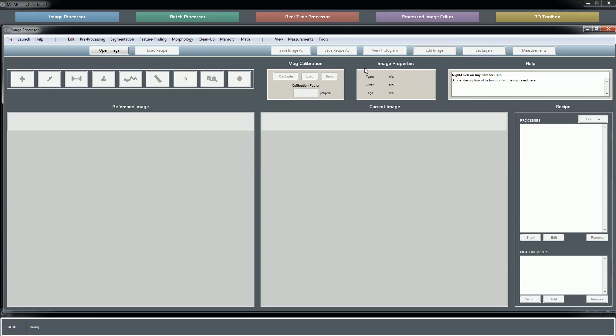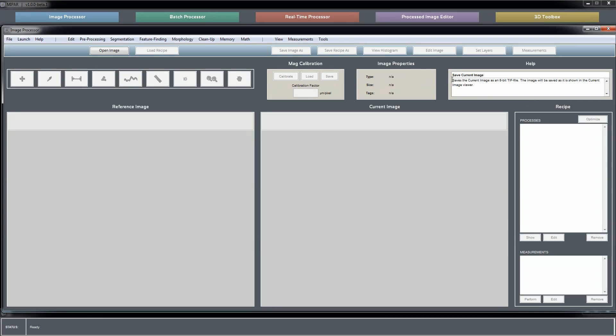Here we have our panel where various image properties are shown. Again, we'll get into this a bit more later, and here's our integrated help box for the image processor. These help boxes are present in the three heavily interactive applications of MIPAR: the image processor, the processed image editor, and the 3D toolbox. Right-clicking on any user interface element will flash a border around it and indicate a bit of help text as to what it does and what it's used for.